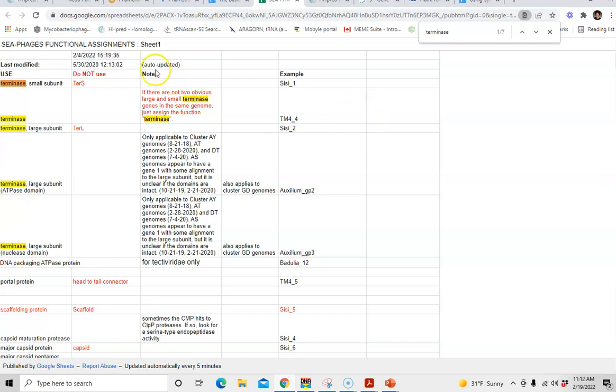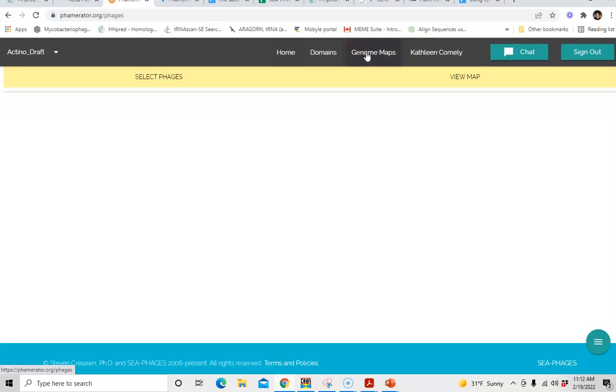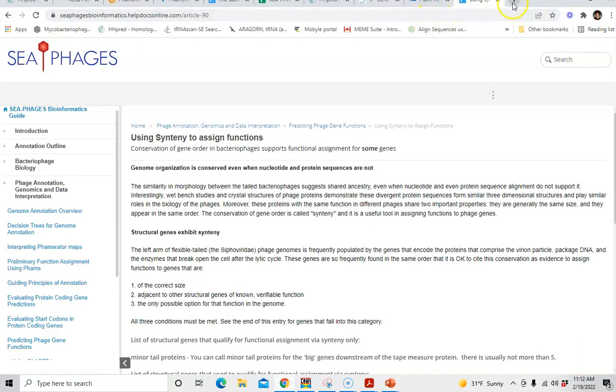The other thing I want to do is go to Phamerator. I am signed in, and I want to go to genome maps. Let me also do this for you too. We want to go back to PhagesDB. I'm not sure, okay, I might just open another tab.